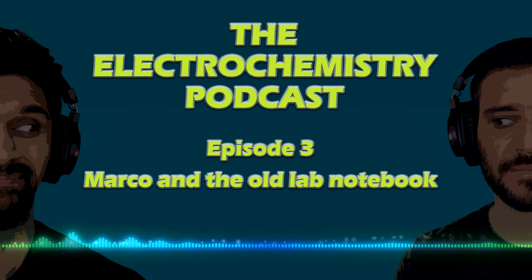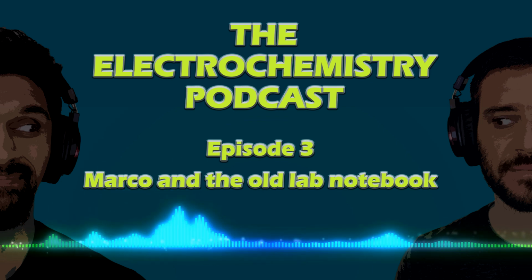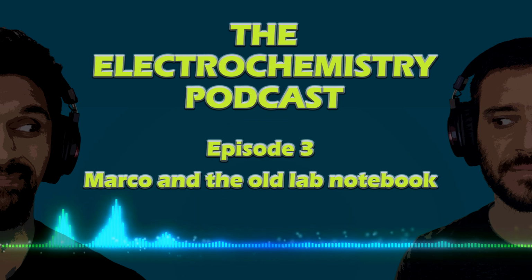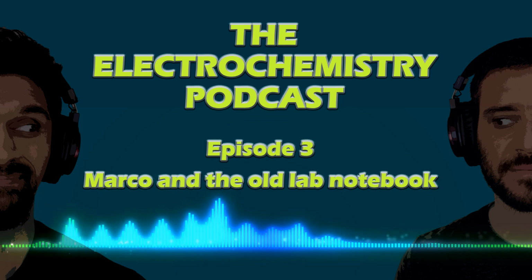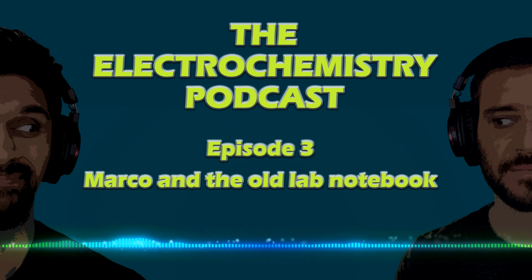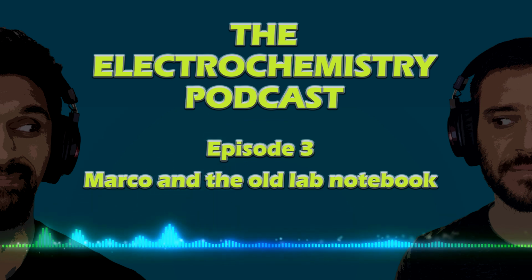However, and not surprisingly, testing his new catalyst wasn't working quite as he expected. Marco noticed that the potentiostat wasn't working. He would tell the potentiostat to apply minus 2 volts, but it would only reach minus 1.3 volts. As a newcomer to electrochemistry, Marco was feeling frustrated. Was the potentiostat broken? Why was the applied potential that Marco set not the potential that was being applied? This is Marco's dilemma.